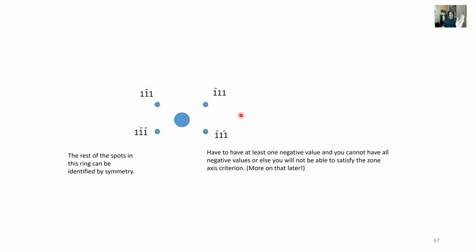If you think of a Cartesian coordinate, it's like quadrant 1, 2, 3, 4, I believe. So that's kind of how I did it, 1, 2, 3, 4. And so the second one's going to be opposite of 1. This last one's going to be the opposite of quadrant 2. Okay, and hopefully that is clear. Clearer than mud is my goal here.